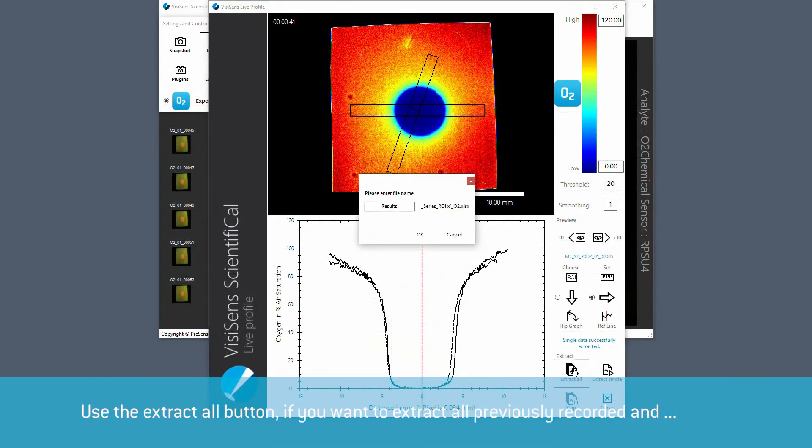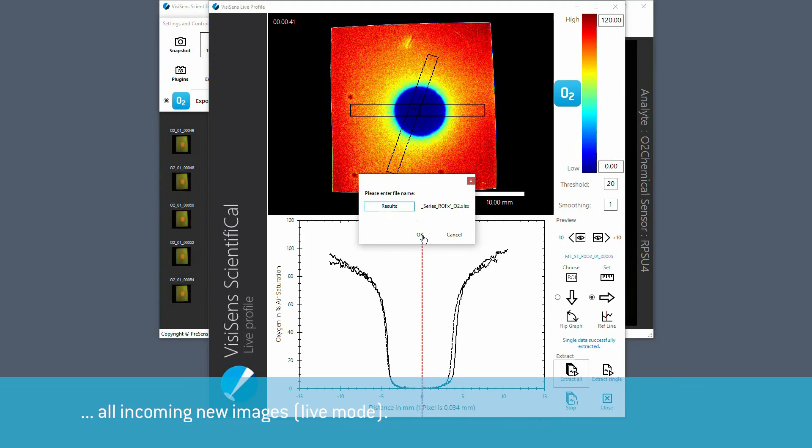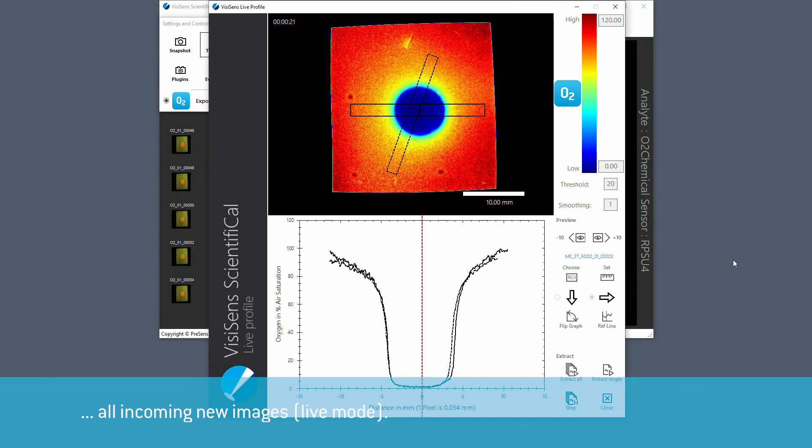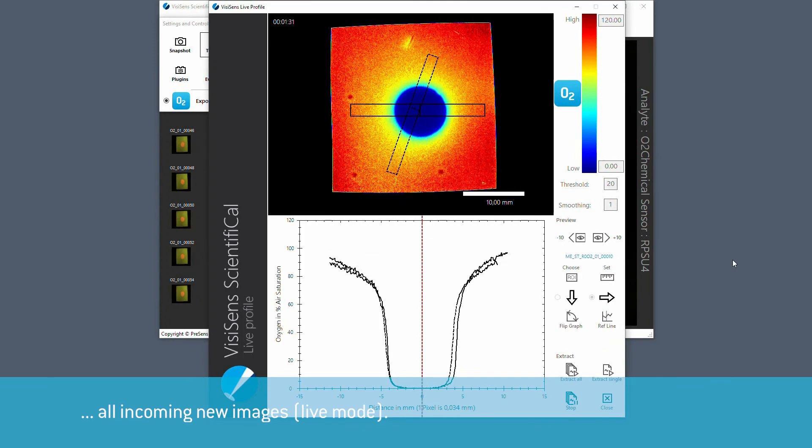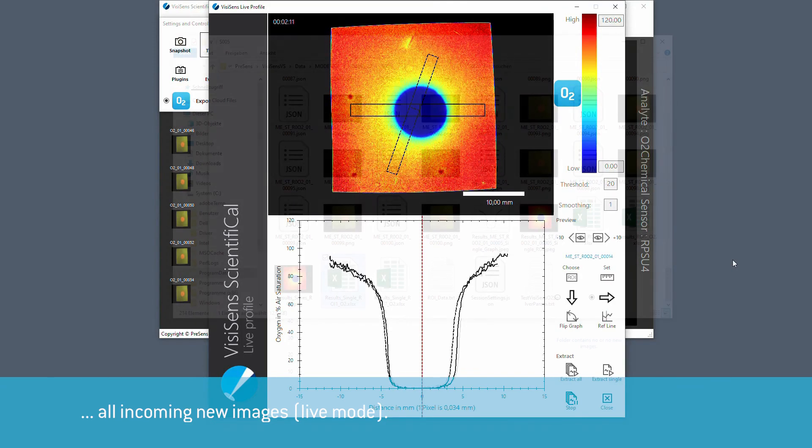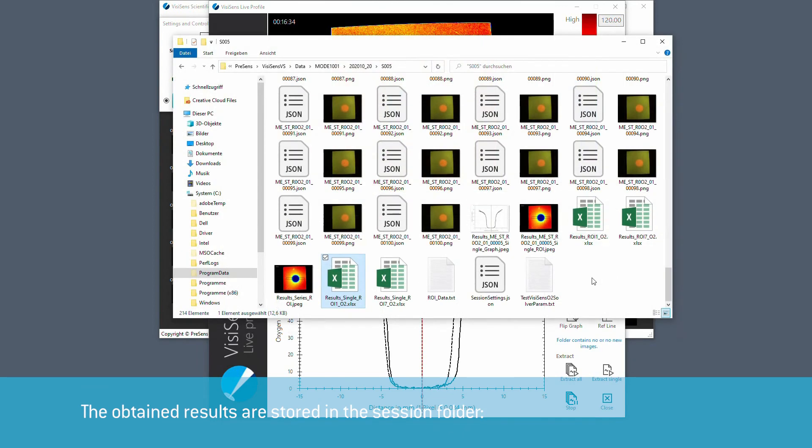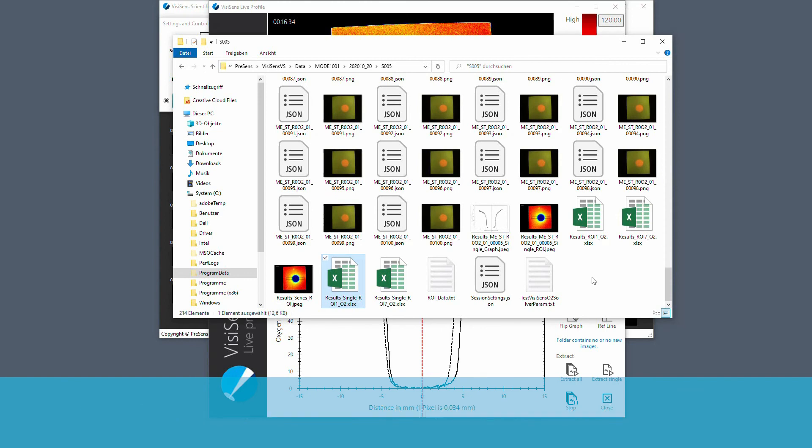You can also use the extract all button if you want to extract all previously recorded and all incoming new images. The obtained results are stored in a session folder. An excel file, an image of the ROI selection, a result graph image and the ROI coordinates in a text file.